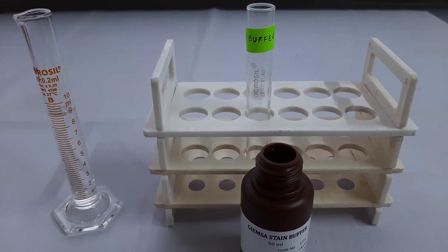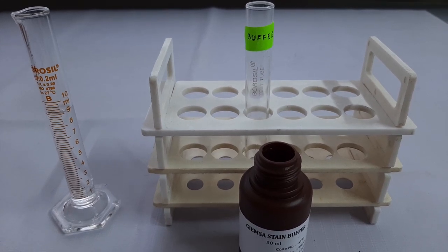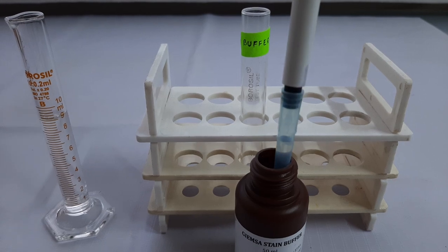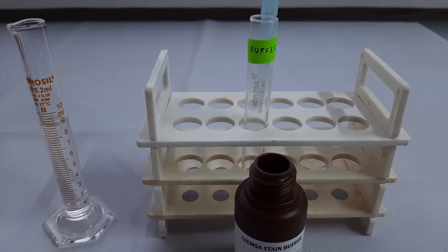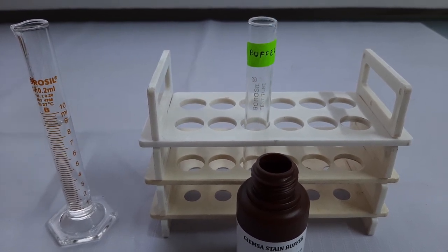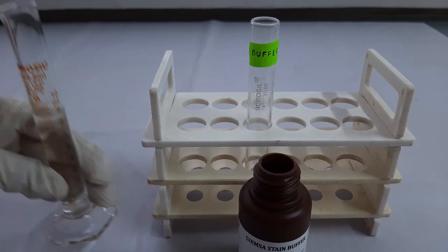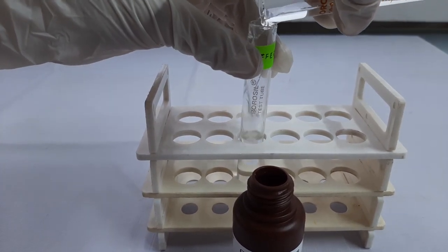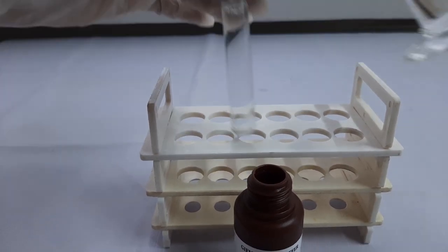As per the procedure, first, we will take 1 ml of the buffer from the kit and add it to a tube which we have previously labeled for the buffer. In that tube, we will add 9 ml of distilled water and then mix it thoroughly.